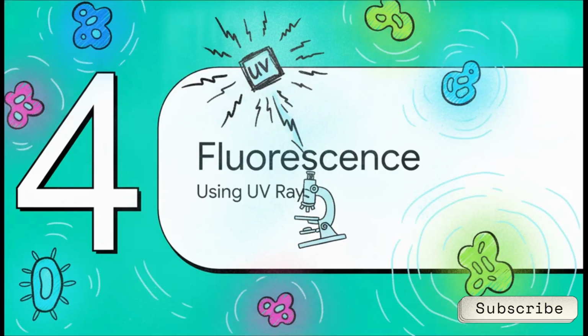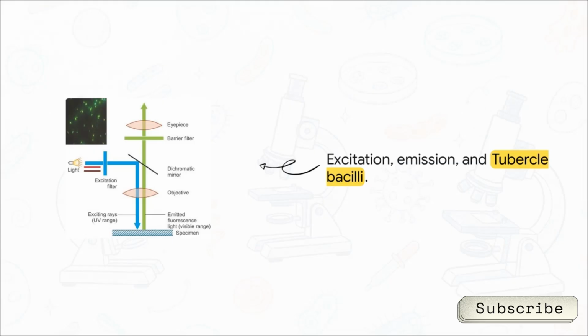On to Section 4, Fluorescence microscope. Now, this technique uses invisible, short-wavelength ultraviolet rays to generate a visible, glowing image. Here's how it works. An excitation filter lets in only those short UV rays. These rays hit your specimen, which you've already coated in a fluorescent dye. The dye gets super excited by the UV energy and immediately emits light of a longer wavelength, which conveniently falls right in the visible spectrum. That emitted light travels up through a barrier filter, which keeps your eyes safe from any leftover UV rays, and the result is stunning, glowing images like the bright green tubercle bacilli.